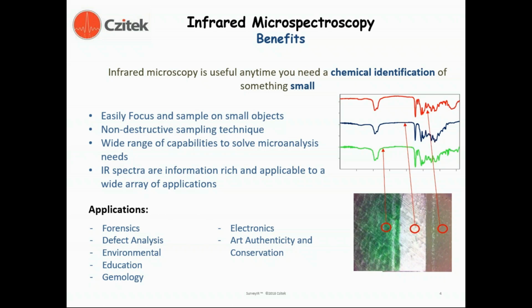Shown in this picture on the right-hand side is a very simplistic view of the power of microspectroscopy. Here we have an aluminum substrate measured in reflection, and the corresponding spectra show that these areas are chemically disparate. You could look at the details in the spectra and see differences due to the pigment and the other additives in the binder.